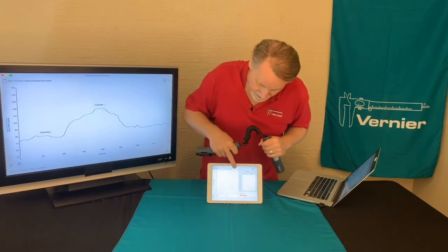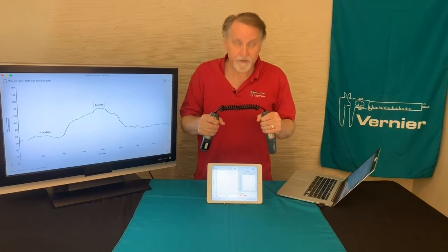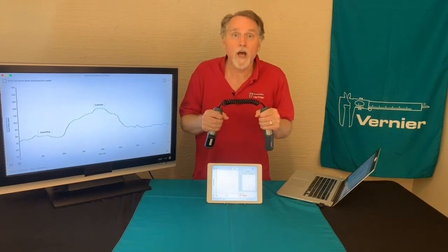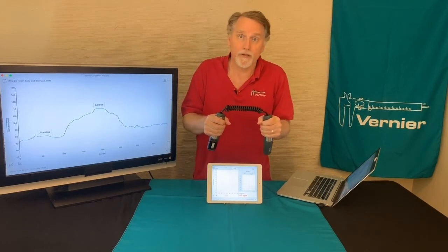So basically if I hit collect, it's just collecting the data over time, and you set it for a long period of time.